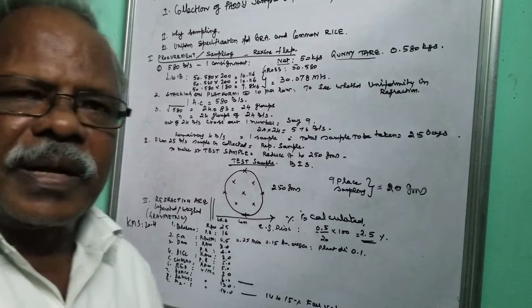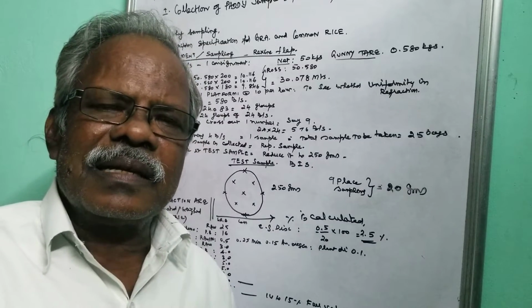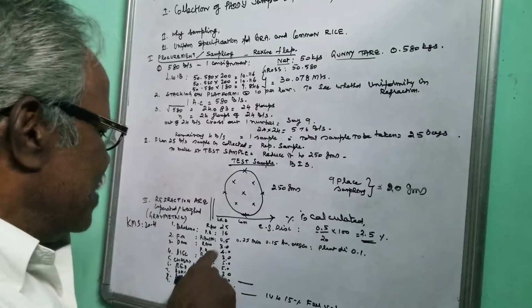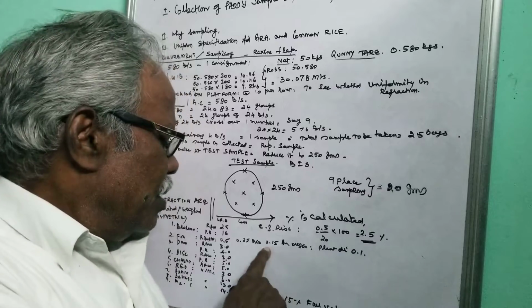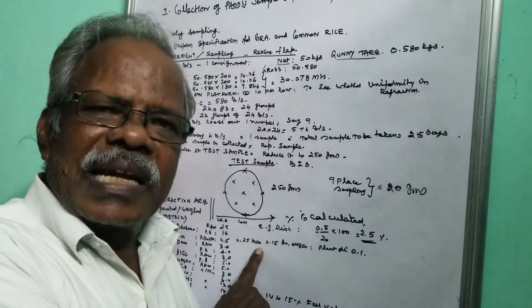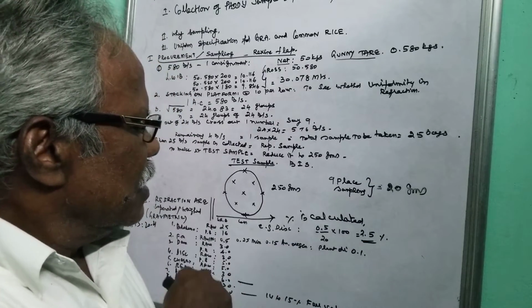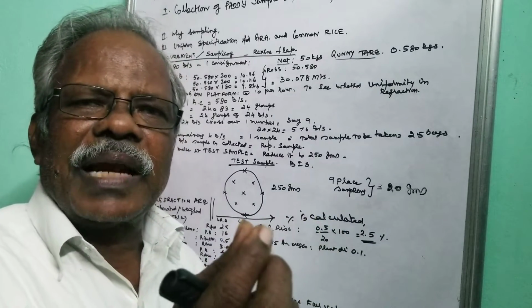Next one is foreign matter. Foreign matter means the dust, sand, and minerals. These things come under foreign matter. The percentage is fixed as 0.5% at the time of procurement. Out of 0.5%, 0.25% is minerals. Minerals means the sand, that is silicon dioxide, and then the animal origin is 0.15.